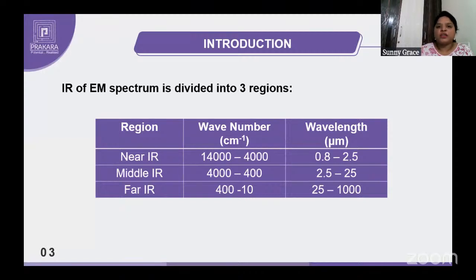And no IR spectra of any two molecules will be the same except the optical isomers, where you will be finding similar kind of stretchings, right? Because of that, there is a possibility that you might be finding similarity for the isomers, but actually fingerprint is something which is not unmatchable, or it is very specific for each and every organic molecule.